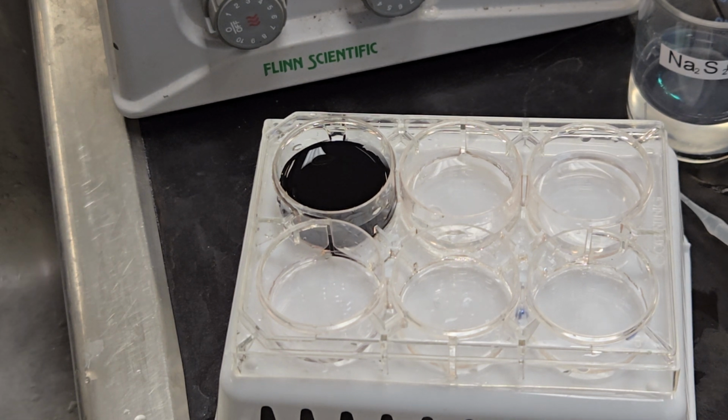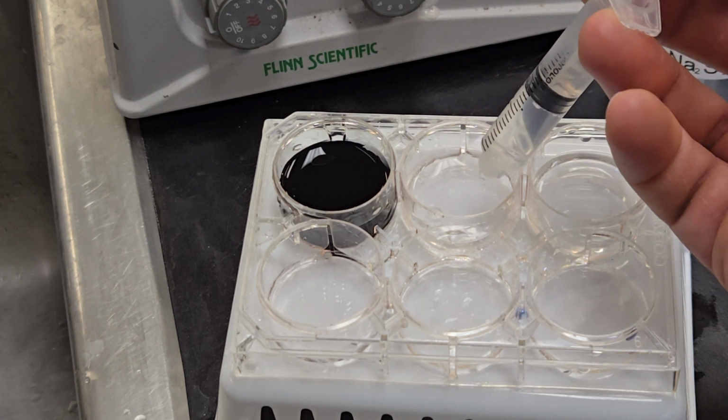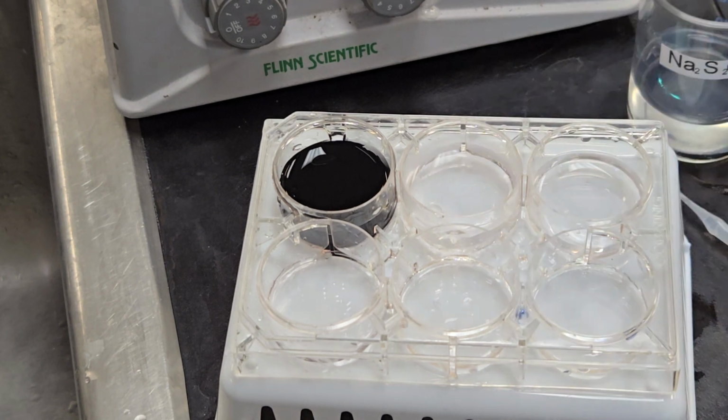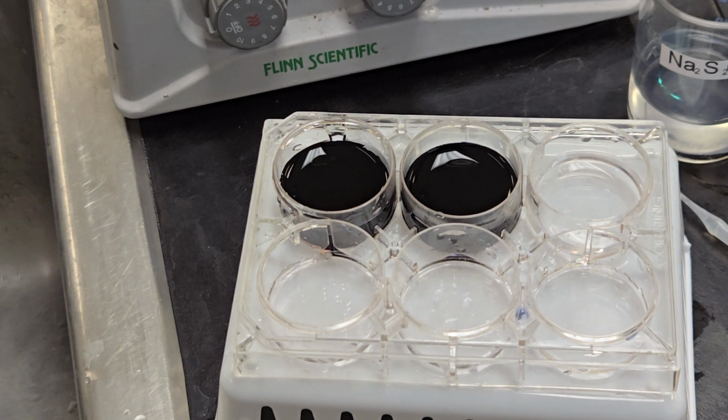You might want to take a guess as to what will happen. Will the reaction happen faster? Will it happen slower? Adding hot right now. Again, use the timer on YouTube. Pretty quick. Now cold. Hopefully your intuition is telling you how this one will be different.